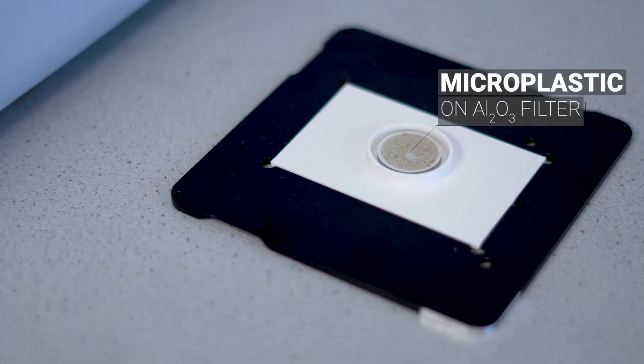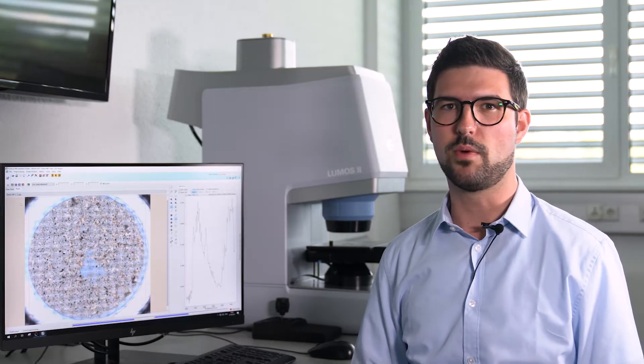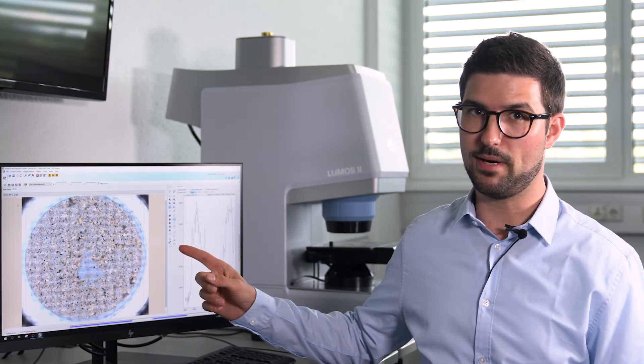This is a microplastic sample. Researchers all over the world are looking for efficient and reliable ways to analyze these tiny plastic particles. But what is the best way to characterize microplastics? Let me show you.